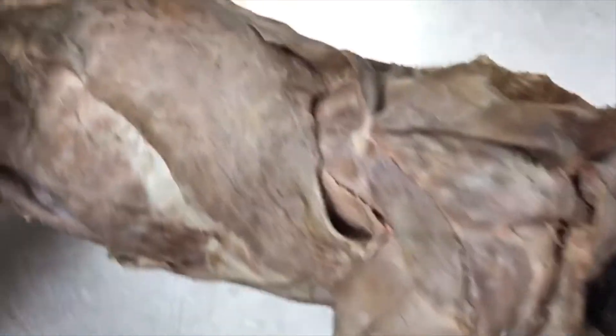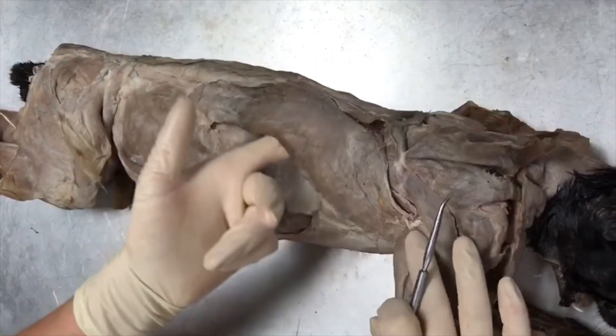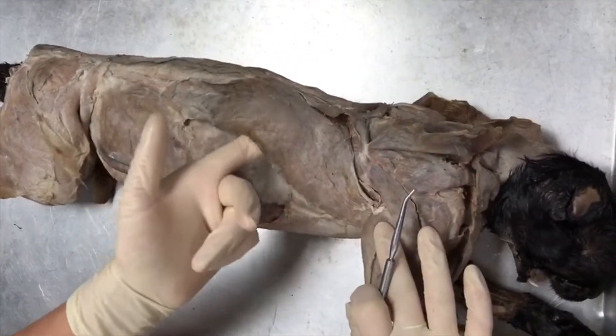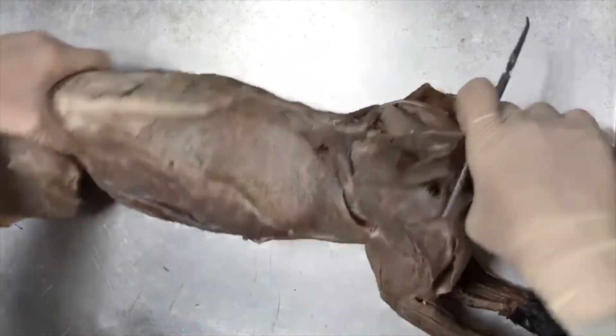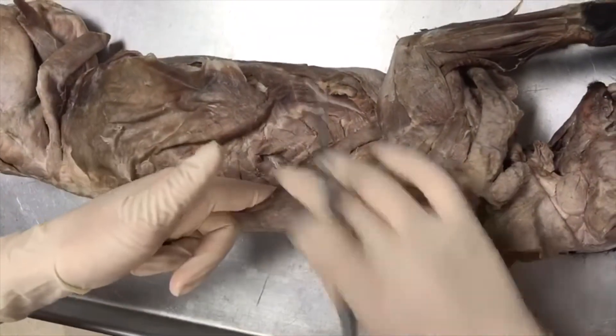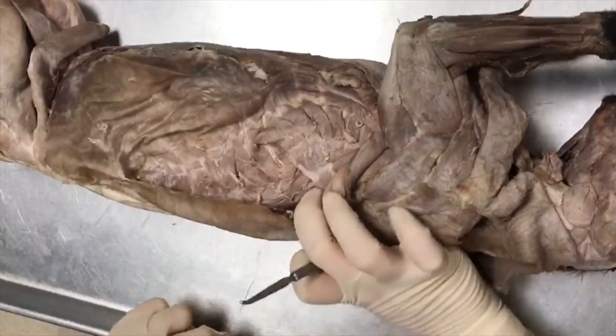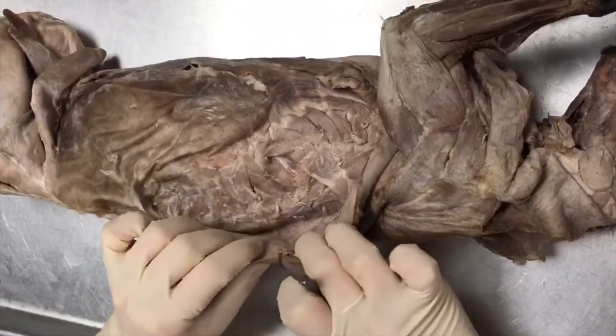Then this large flap over here is your latissimus dorsi. If we flip the cat on this side, this is your latissimus dorsi as well, and underneath your latissimus dorsi is going to be your serratus dorsalis muscles and your serratus ventralis muscles.